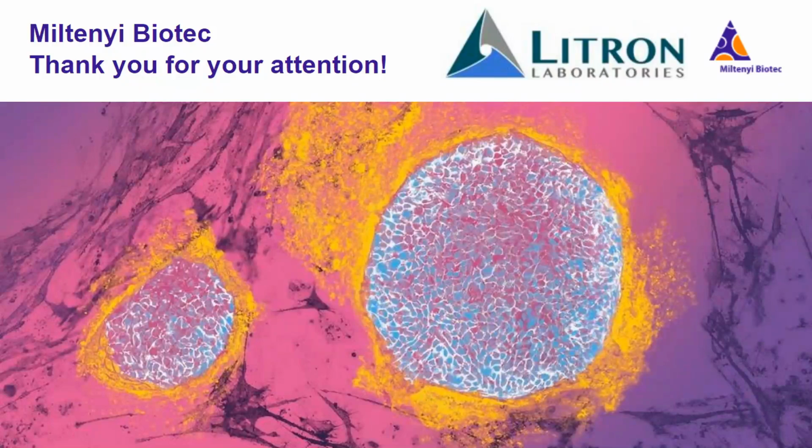Yeah, sure. If anybody's done cytometry before, I'm sure that's what motivated this question. You're tasked with isolating out the populations of cells, to say these ones are positive, these ones are negative, and depending on how obvious that signal is, you may be on the hook to draw the line to say, here's where the negative stops and the positive begins.